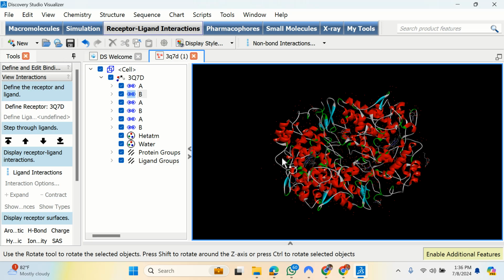For instance, if you have this number reach here, you simply keep removing. That protein is what you must use. You keep removing them until you have just one, which is that top one. Usually the A. Just in rare cases you can use B.